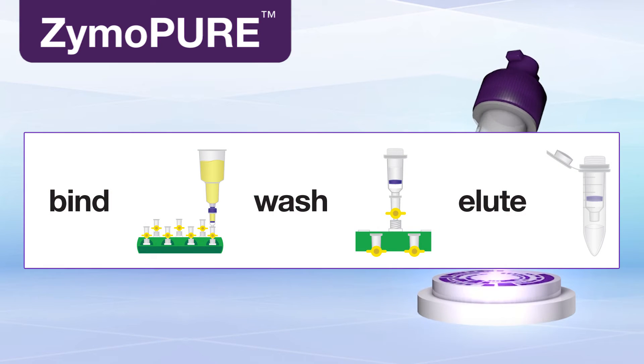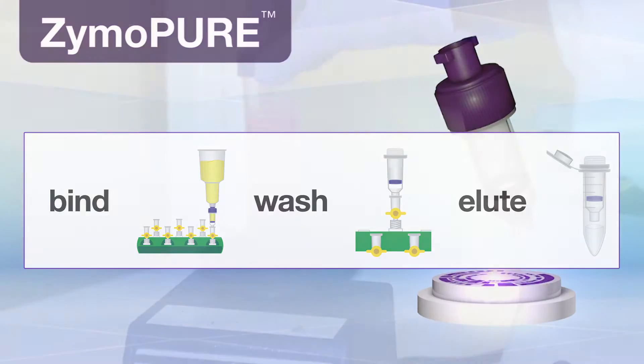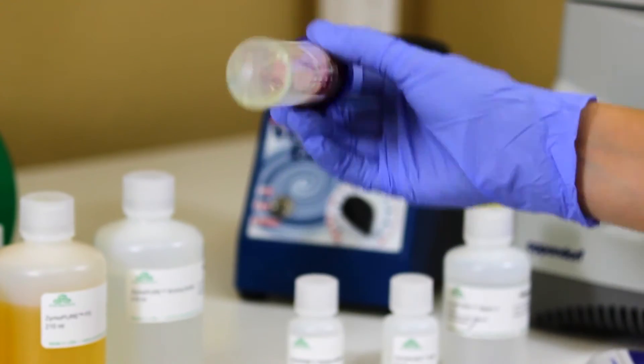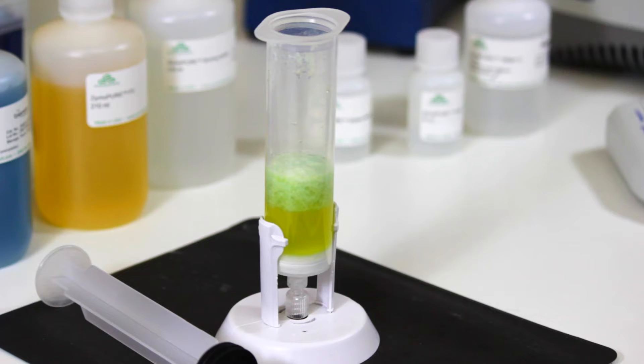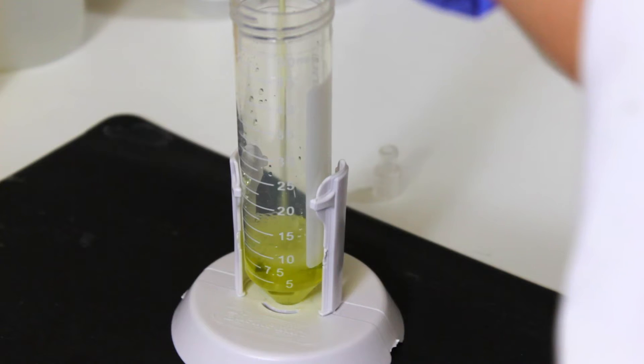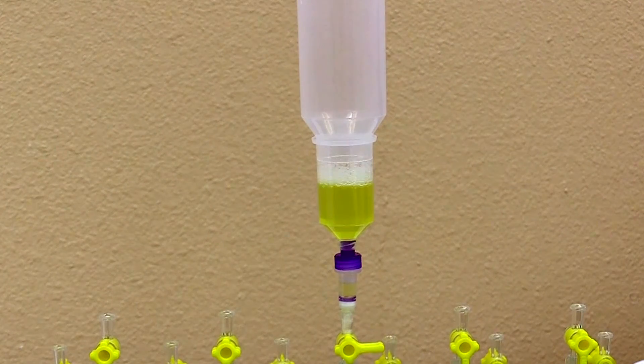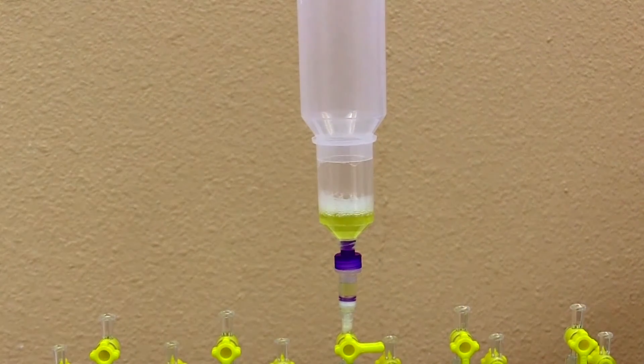Zymopure's streamlined workflow makes isolation fast and easy. Begin by re-suspending your E. coli cell pellet. Lyse and neutralize. Clear the lysate using the included syringe filter. Add binding buffer and load directly onto a Zymos spin column using a vacuum manifold or centrifuge.